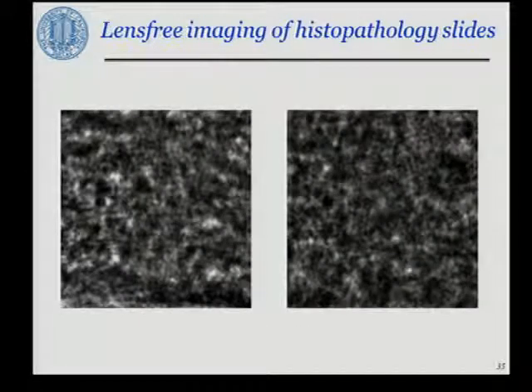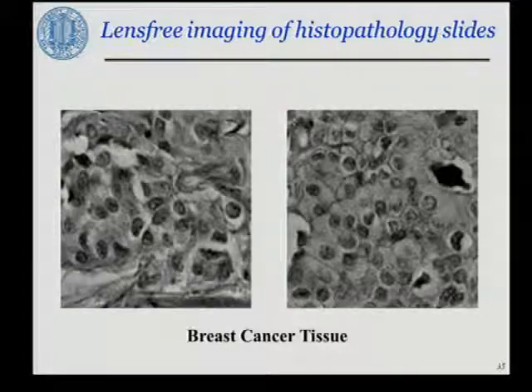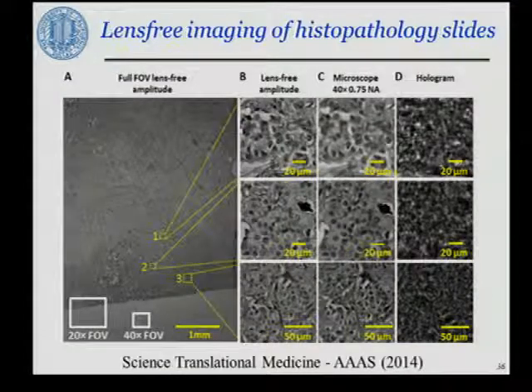And you can take holograms like this and start to essentially go to deeply subcellular resolution through phase recovery. This is a good example where you're also looking at a breast cancer tissue. Typical field of view of a 20x objective is shown here. Maybe a 40x, a higher resolution is shown here. And these are the zoomed-in images showing these subcellular features.